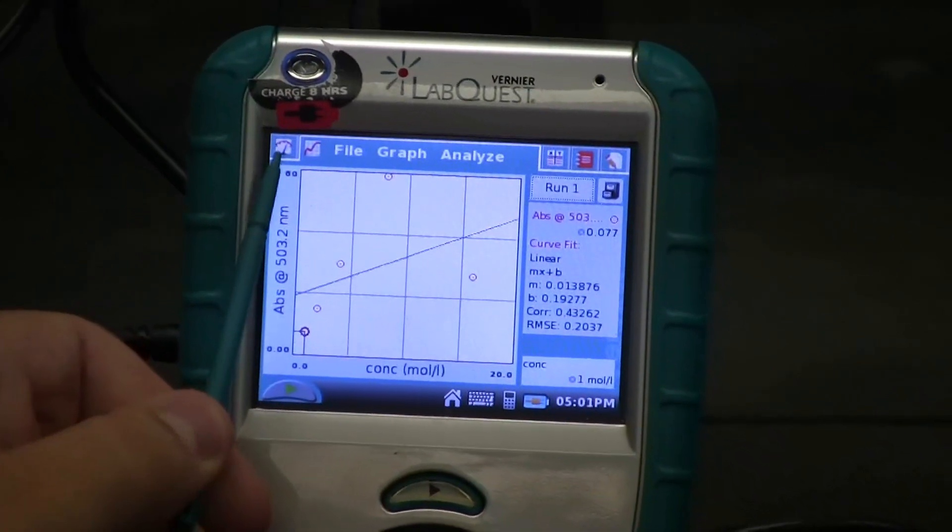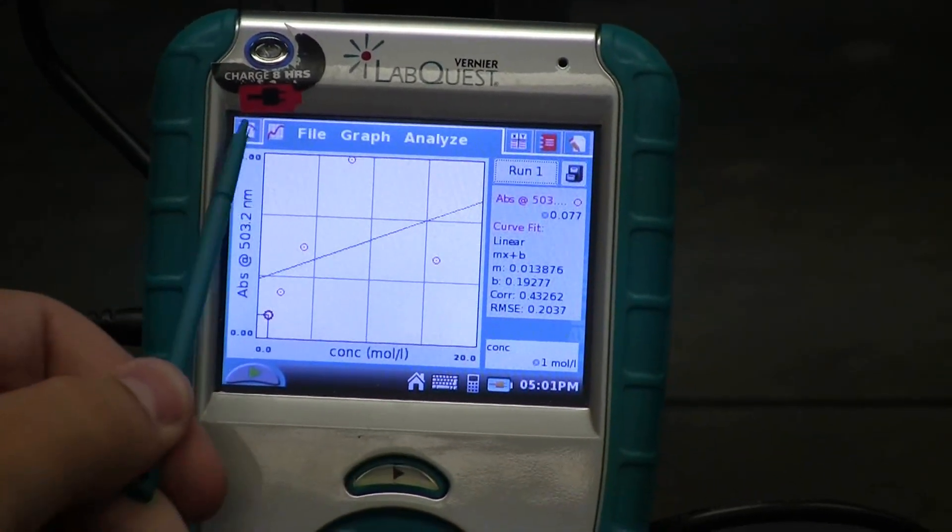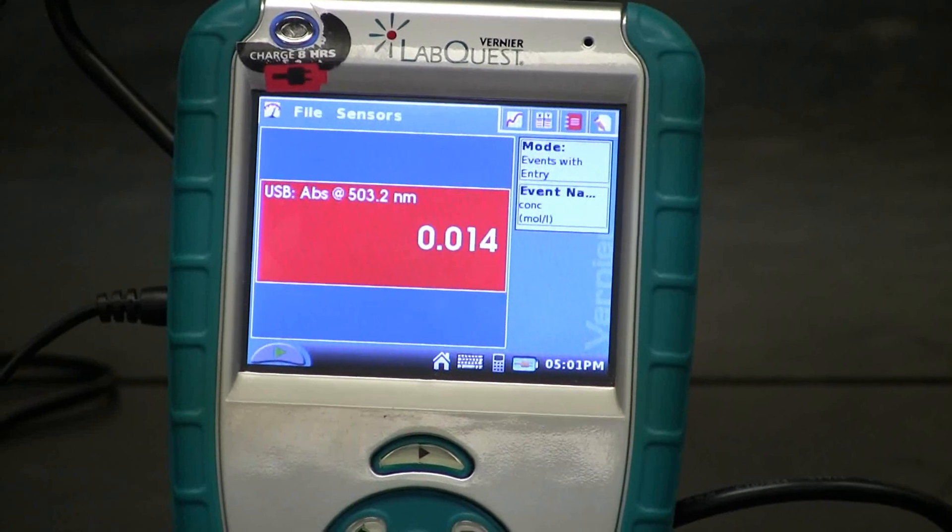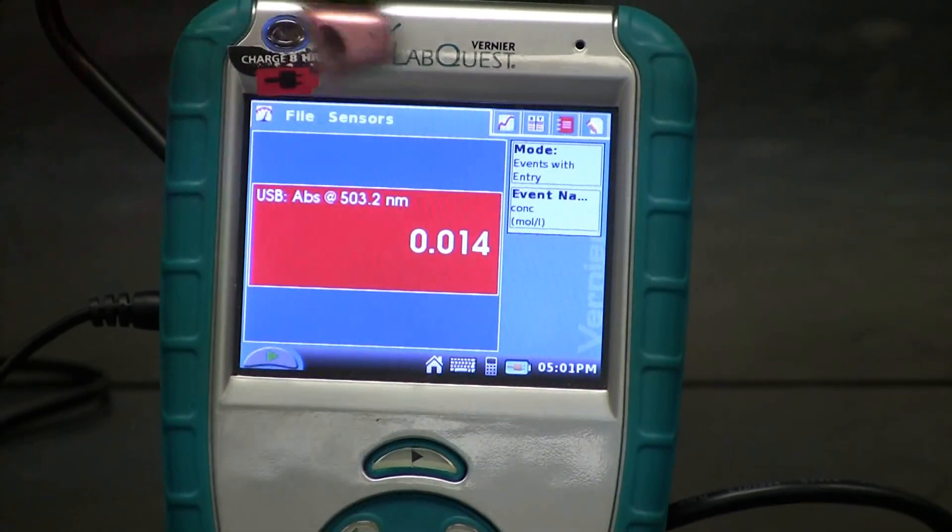Start by clicking on the Meter tab in the top left corner. You are now ready to test your unknown solution.